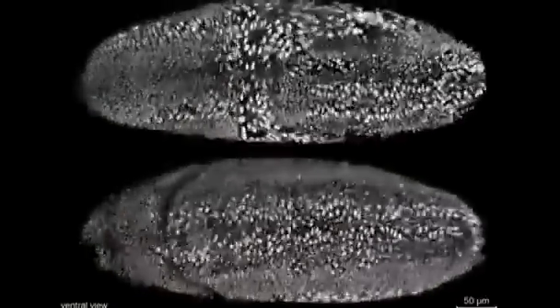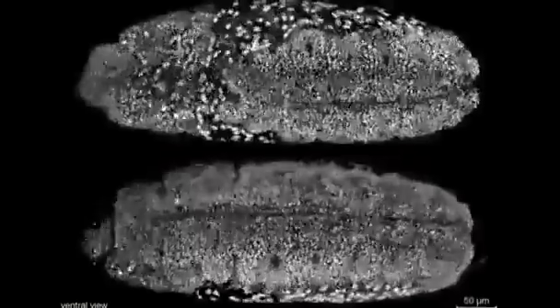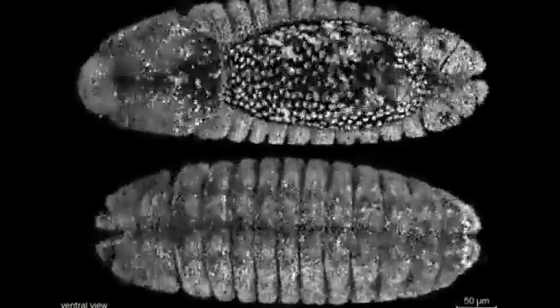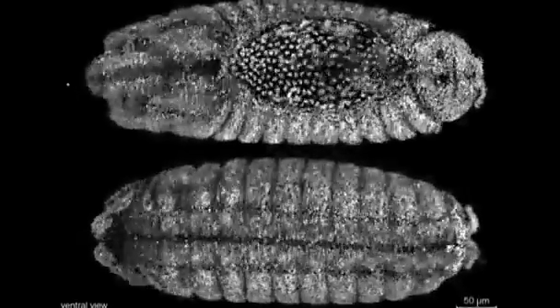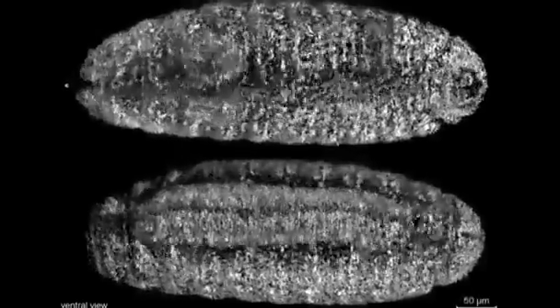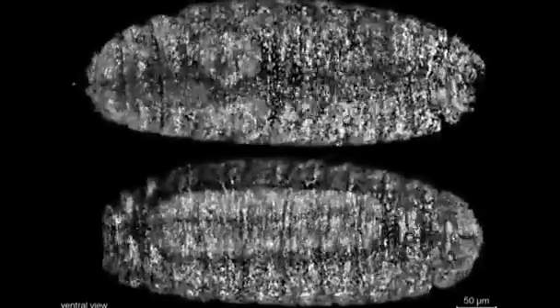And the technology is not limited to recording the activity of zebrafish brains. Here, in a compilation of millions of images recorded over 20 hours, a cluster of cells evolves into the elongated body of a fruit fly embryo, with muscles forming moments before it becomes a fully formed larva. One typical experiment we would do with this microscope, and that is not possible with a different imaging system as they existed up to this point, is to really follow basically all of the cells in a developing embryo.